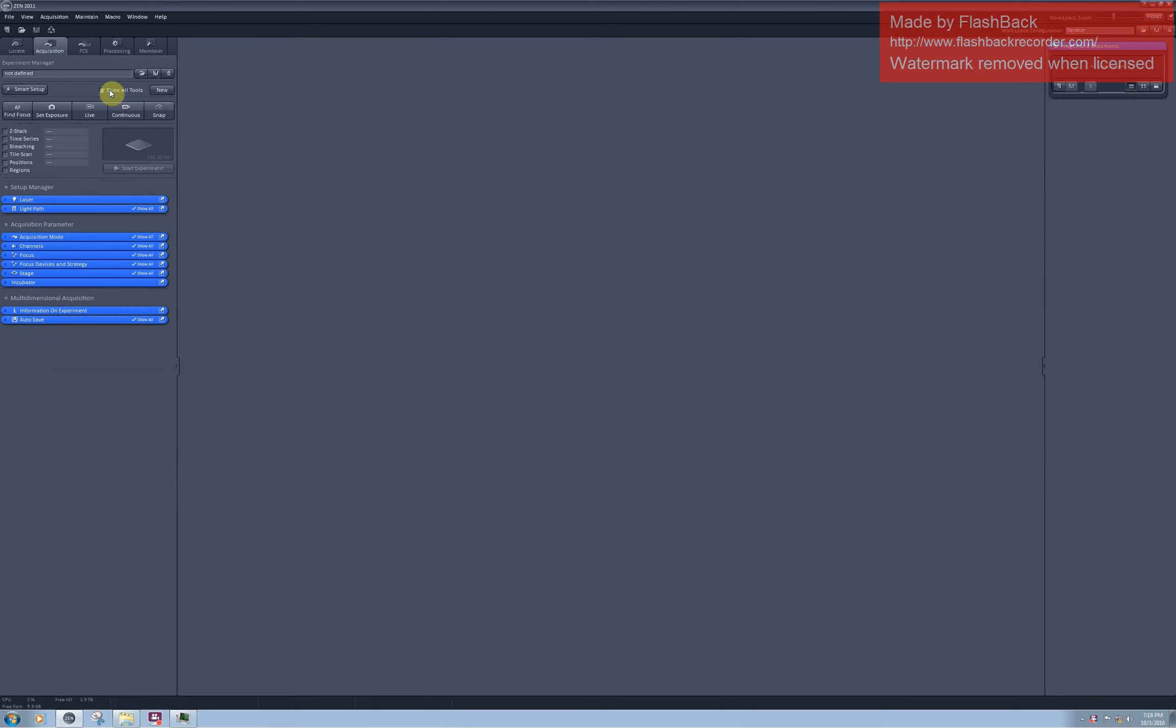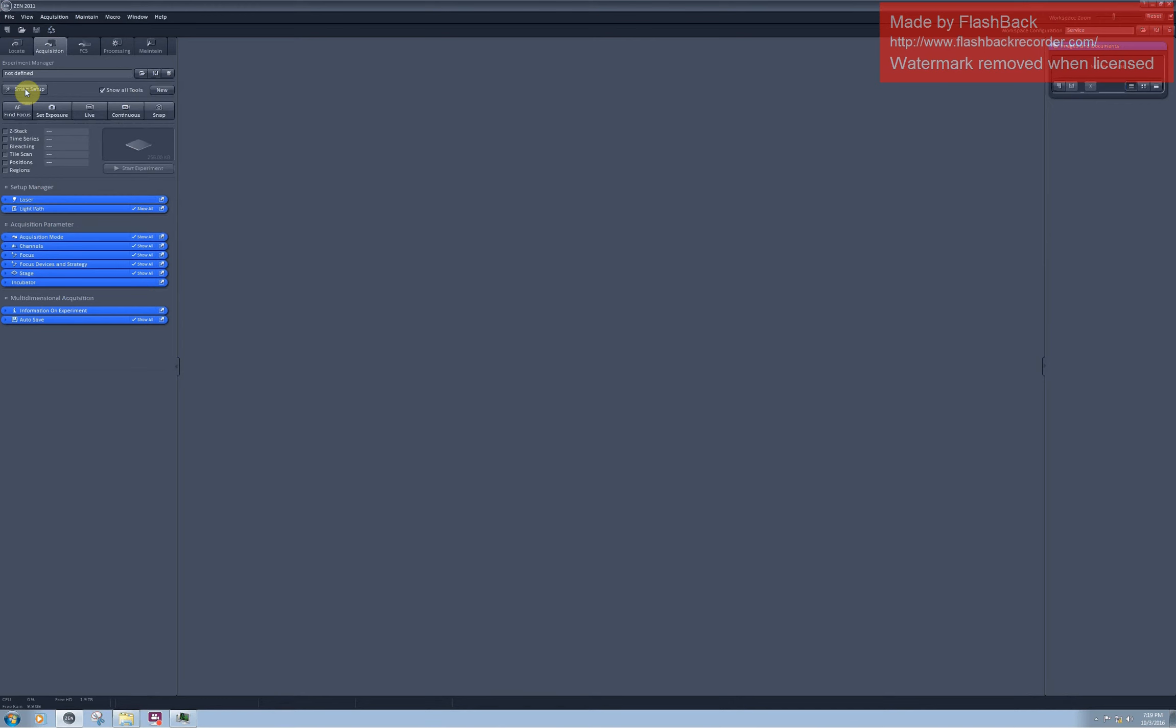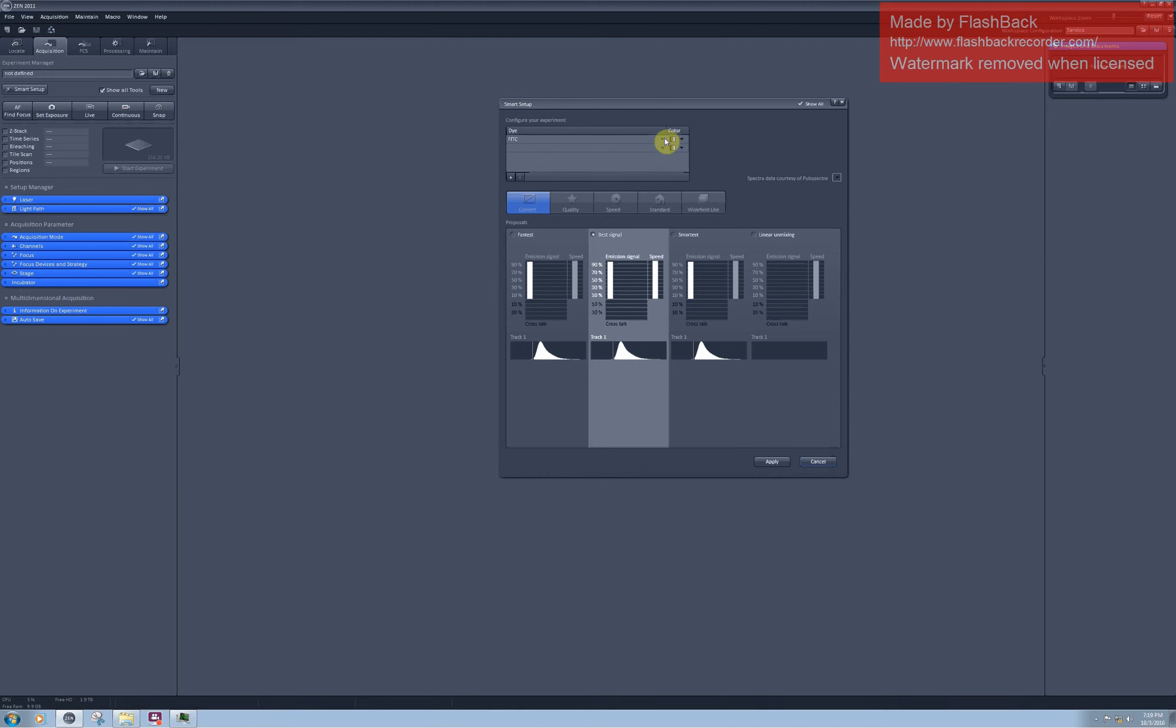You can ask the software to help you configure the light path for exciting and detection of your fluorophore. For this, you should go to smart setup here. This is a large database of the emission and excitation spectra of different fluorophores and also hardware settings for their detection. Most probably you will be able to find your fluorophore in the list.